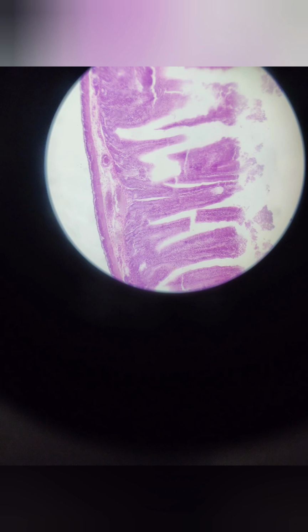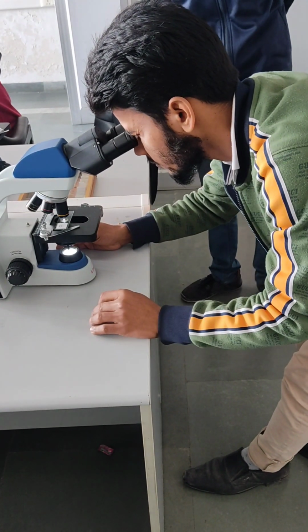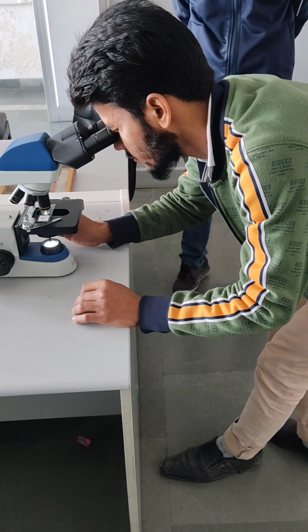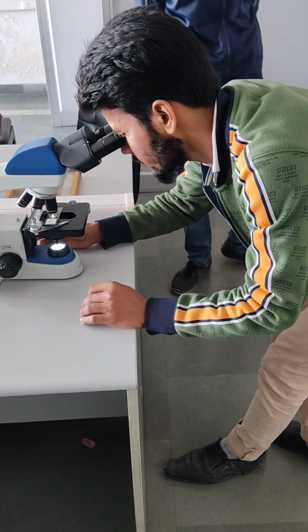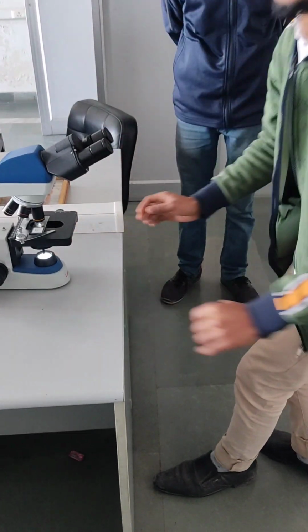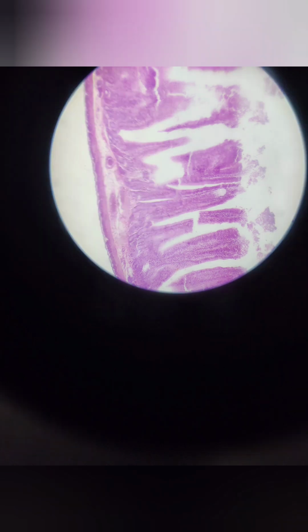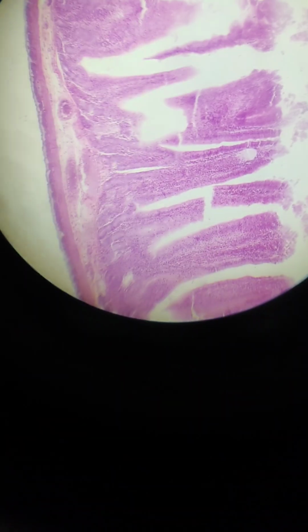Hello students, I'm just trying to watch the transverse section of human rectum with the help of a compound microscope, how it will be seen under a powerful microscope at high magnification. You can watch it, you can see the zoomed portion of the transverse section of human rectum just like this. This is basically the human rectum, how it appears. This is basically a recording of a permanent slide that I have seen recently, and I have captured this video.